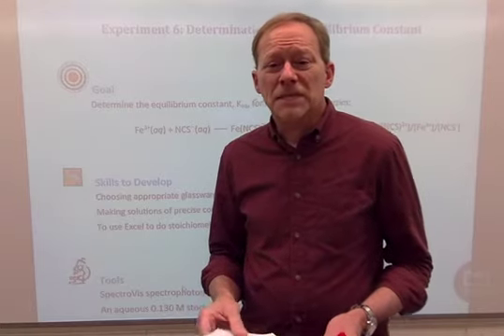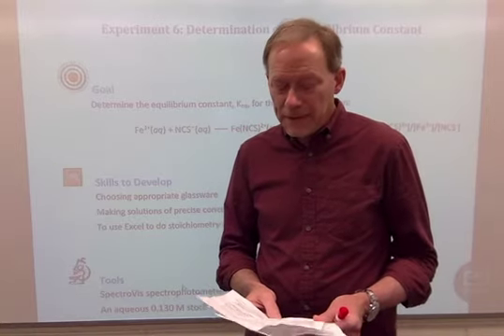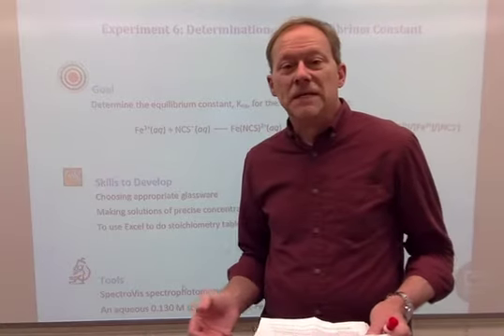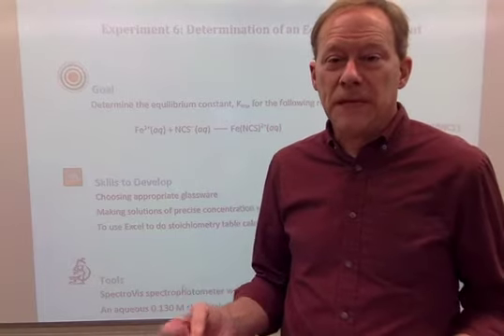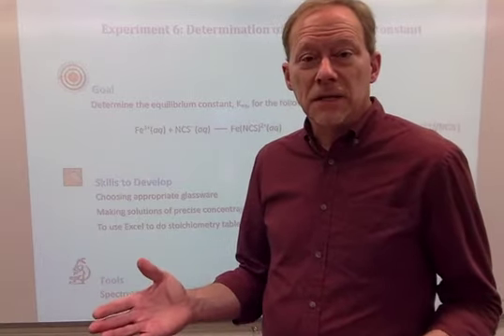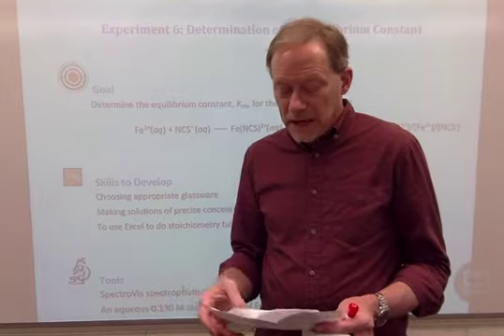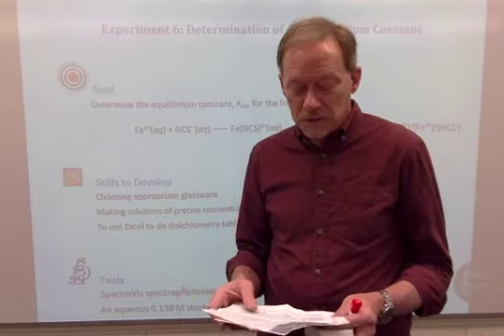This is our first experience with online learning for Chem 104 lab. And what we have is a pretty ideal lab to get started with, and I say that for 3 reasons. One is that you've already had some experience making up a solution in the lab. You've also had experience calculating the final concentration after making the mixture. And you've already done measurements of absorbance in the lab. And so everything that we show you in the lab work will be familiar to you.